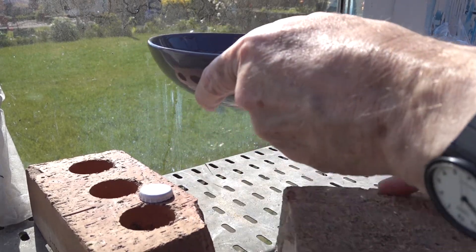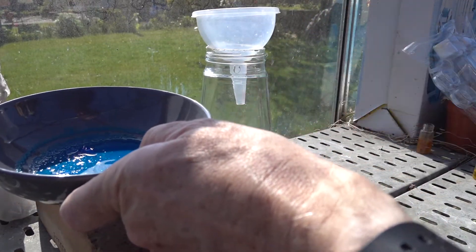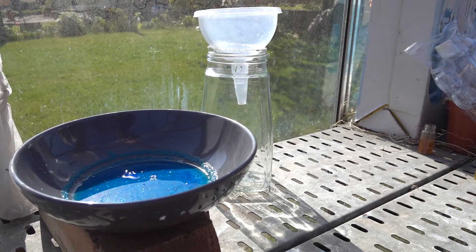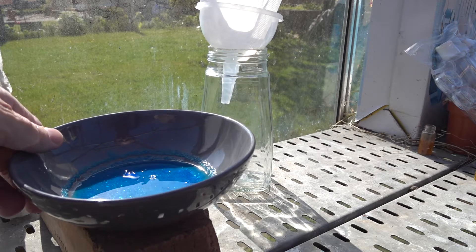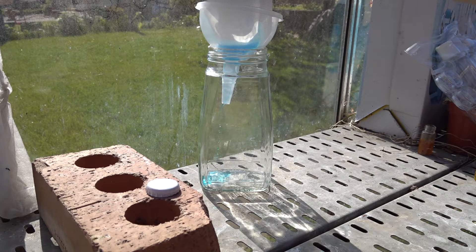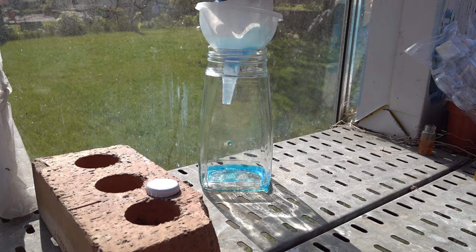So let's just rearrange things a little. Here's the funnel and here's the filter paper. We can keep the filtrate in this case and crystallize some more copper sulfate, but the idea is to get some good crystals out first. Here's the first batch — in goes the solution and here come the crystals. A splint is not the ideal piece of apparatus to get the crystals to come out, but it will suffice.